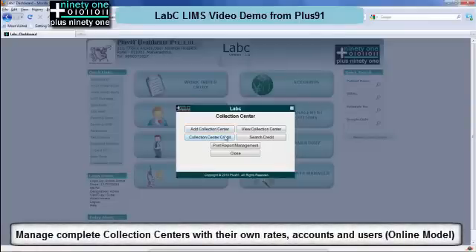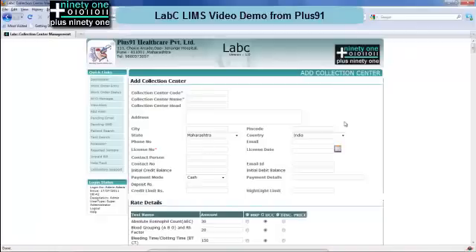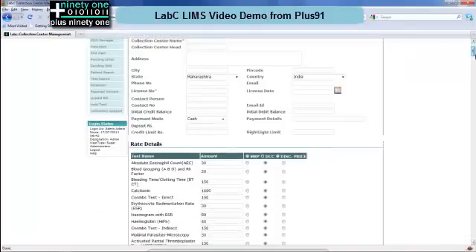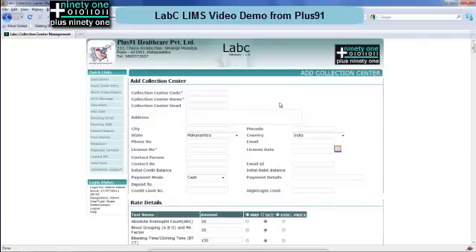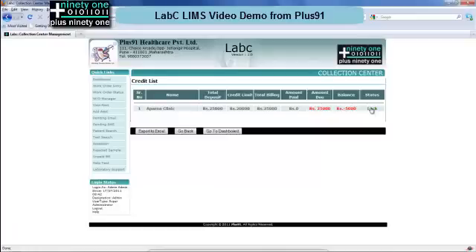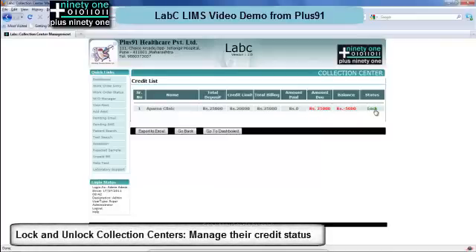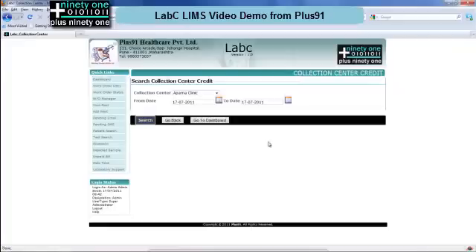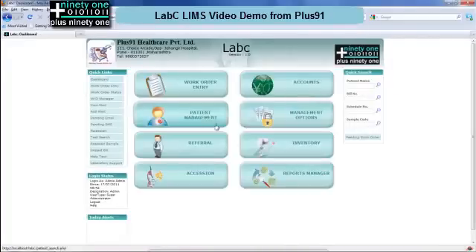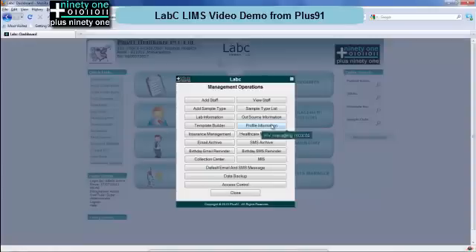Next is the collection center module. The collection center basically allows you to manage collection centers. You can create all the collection center details, select the rate list applicable to them, and define their credit limit and deposit required. Here you can see a single collection center with the total deposit limit, total billing, amount paid and their status. Here you can lock or unlock the system and also do credit and debit notes. Collection centers also have their own login modules to log in and enter work order entries.